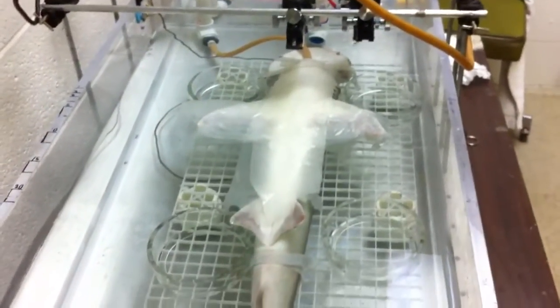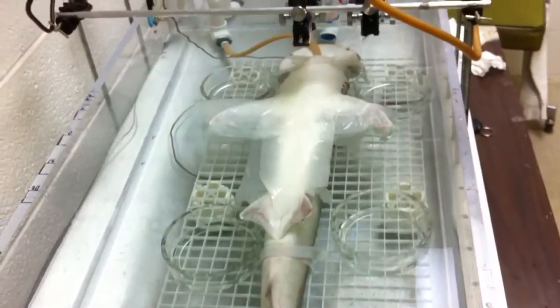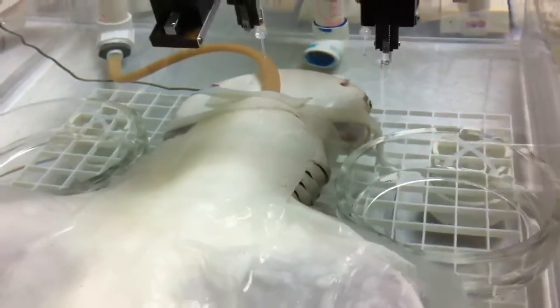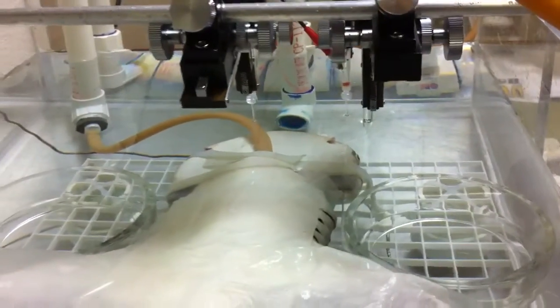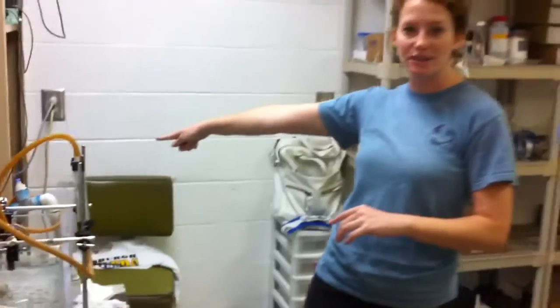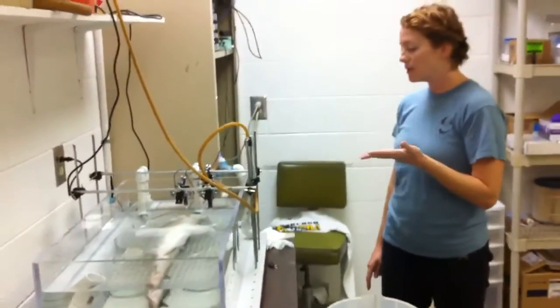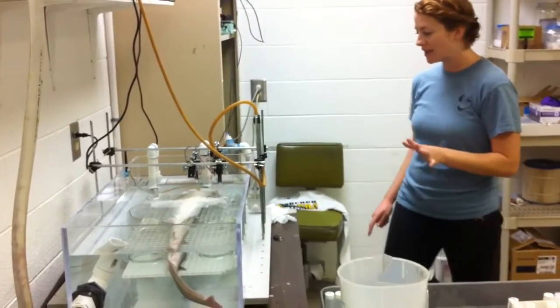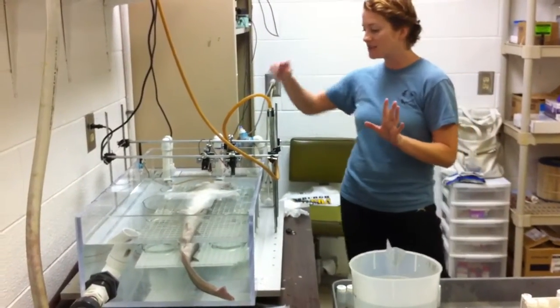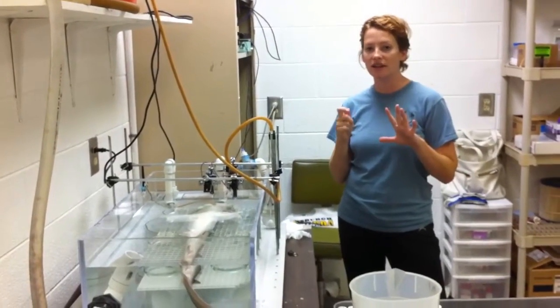And you've done this to the shark before? Yes, a lot. So my first round of experiments were just really basic, trying to see what odors stimulate them the most and how sensitive they are to the odors. So I would cut down the concentration lower and lower and lower to see how low they can go, and I can still see a response. Okay. So that way you can figure out their sensitivity. What I'm doing now is a little bit more complicated to explain. So this delivers seawater into the nose, and over that background of seawater I inject the odors.